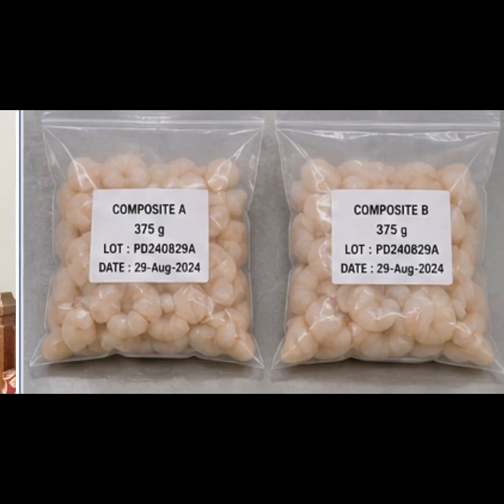So at a 1:9 ratio dilution, the 375 grams is blended in 3375 ml of primary enrichment broth. We have to put it in the primary enrichment broth.